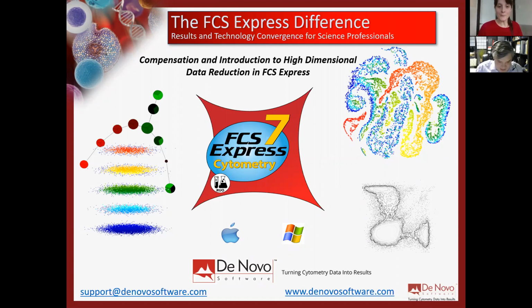All right. Yeah, thanks, Kathy, and thanks everybody for joining us today. So today we're going to be going through some of the compensation tools in FCS Express and also giving folks a kind of introduction to high dimensional data reduction using tools like tSNE and viSNE and FlowSOM. And you might wonder, why do we pull together these two topics? In reality, compensation is a type of transformation on your data, just like tSNE and viSNE and other tools are transformations on your data too.